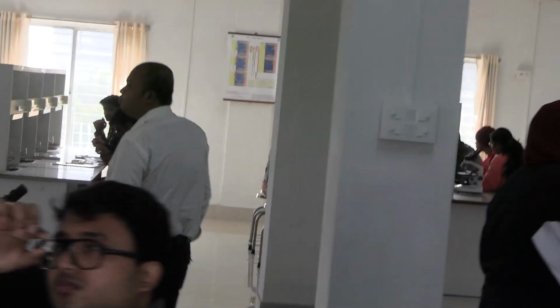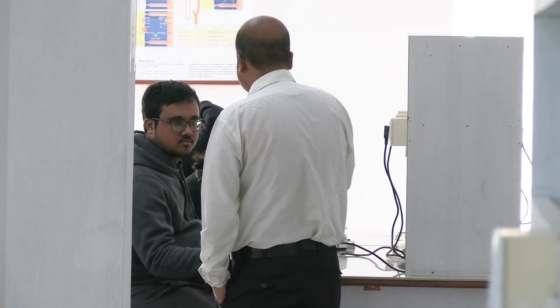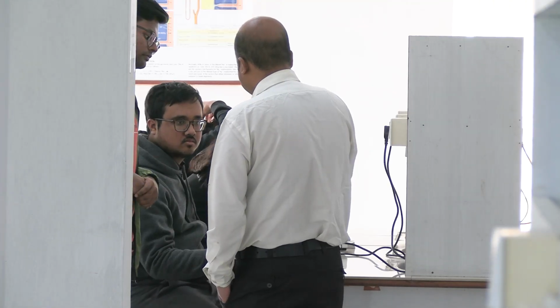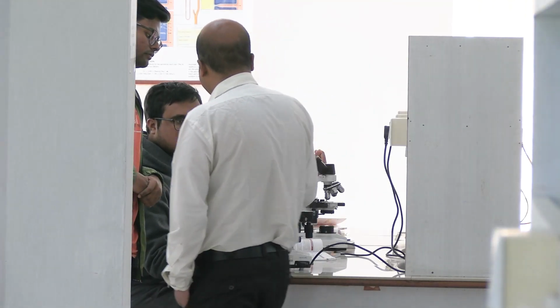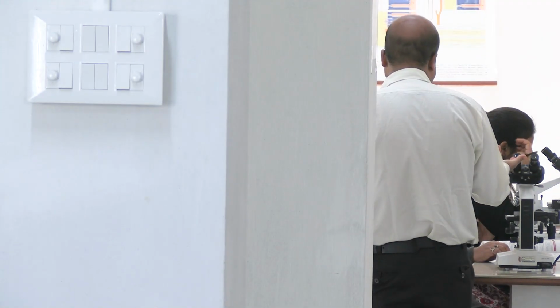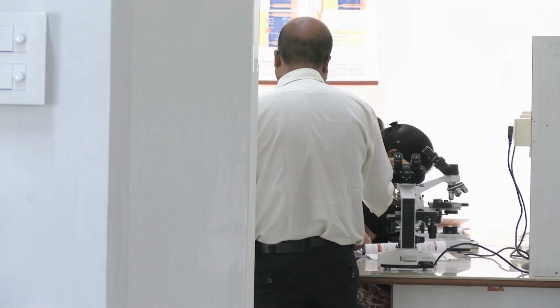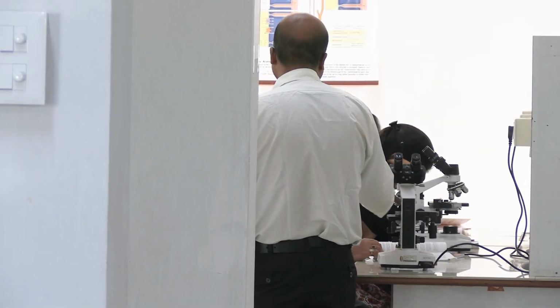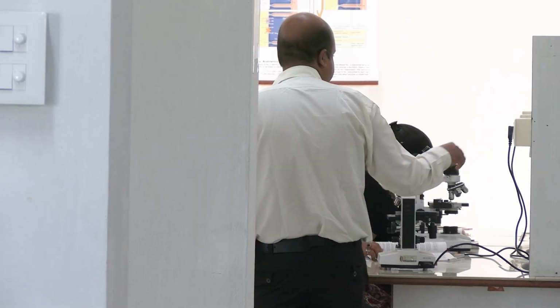Who is the student who joined just recently? These are lenses. This is the eyepiece lens. The magnification of the object will be by this lens and this lens together. These are called the objective lenses. There are three types. One magnifies 10x.